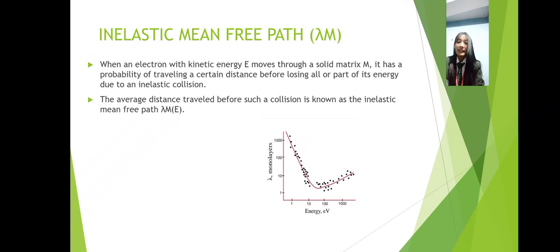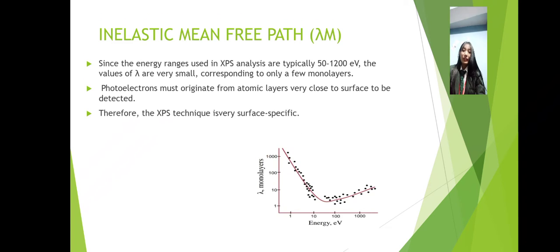Point number 2, the average distance traveled before such a collision is known as the inelastic mean free path, lambda M,E.